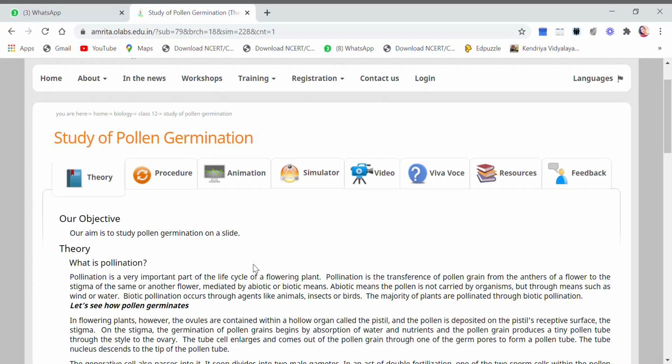Good morning, children. Today we are going to do our first practical from the labs. The first practical that we are going to do is the study of pollen germination.